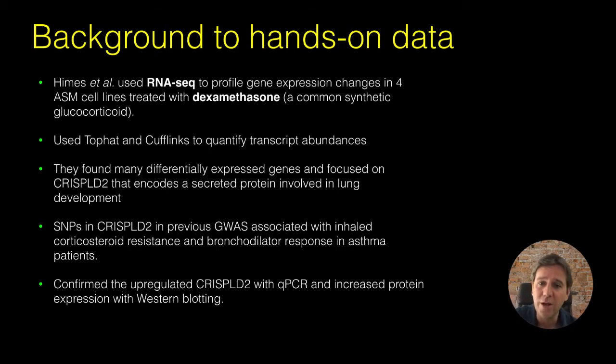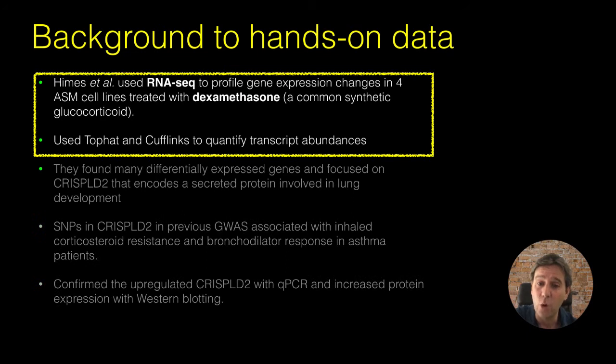So we're going to go and dig into this data a little bit more because there's actually lots of really nice findings that we could get out of this data set, and we're going to see what we can find out. So you see how to analyze this data with a view of being transferable across different data sets that we could go and download and analyze in this way and mine for interesting biology that we want to investigate further.